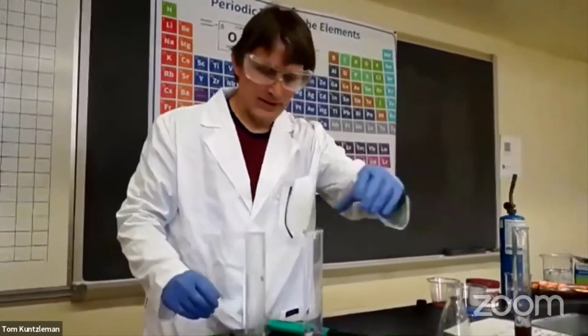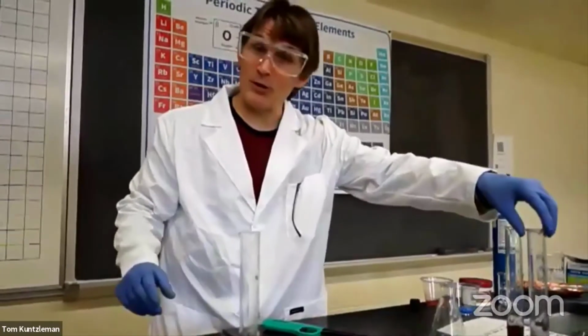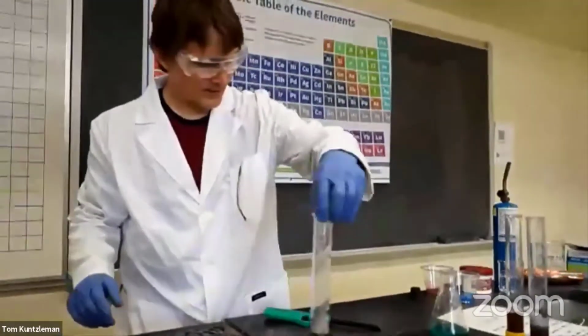Okay. At this point in our presentation, we're going to go on a field trip. We're going to go to the hood. When we say the hood in a chemistry class, we don't mean the neighborhood.